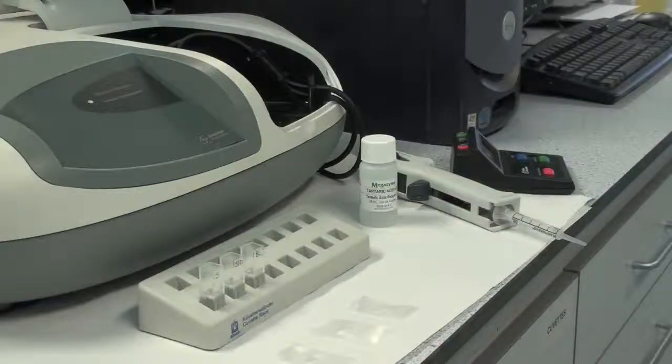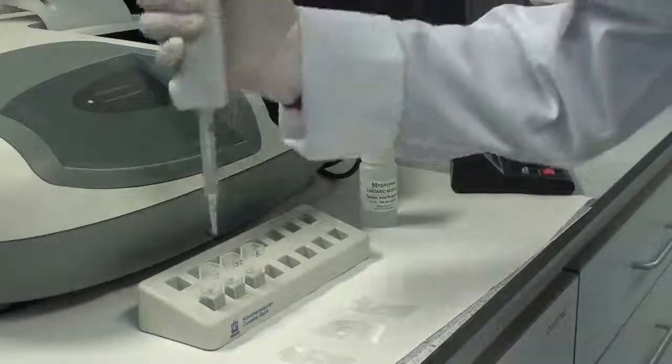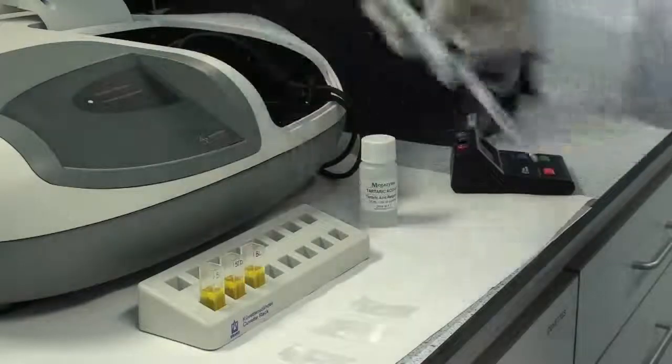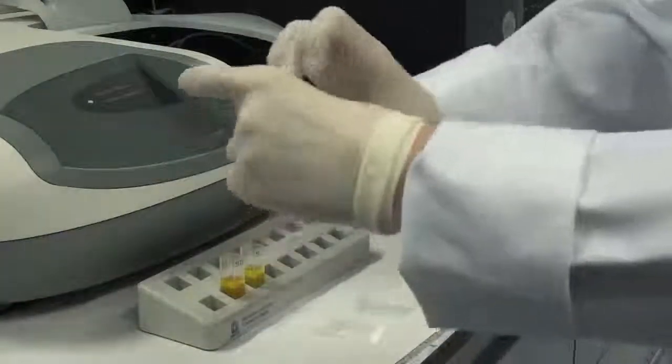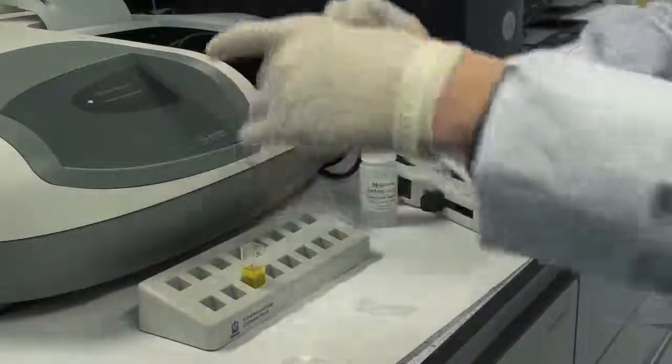After reading absorbance A1 for each solution, add 0.25 millilitres of Tartaric Acid Reagent 2 to each sample, standard, and blank. Mix each solution, then exactly four minutes after the addition of Reagent 2, read absorbance A2 for each solution.